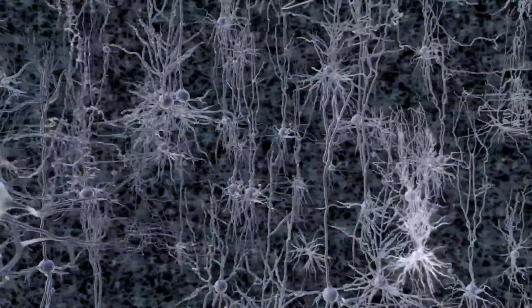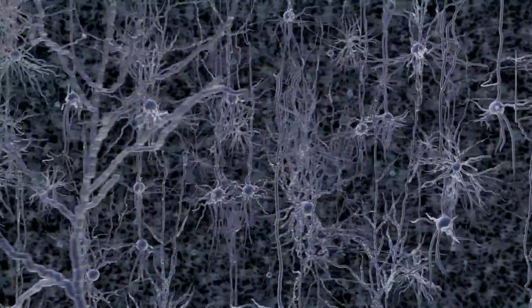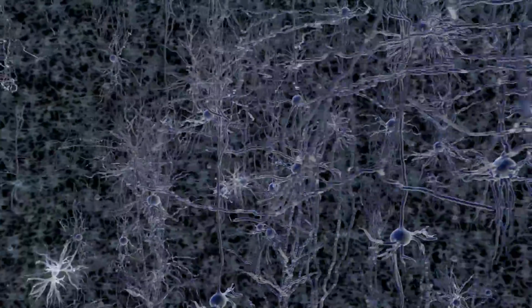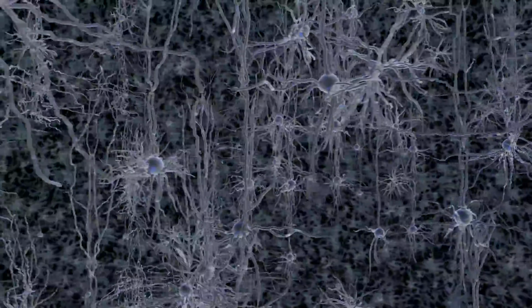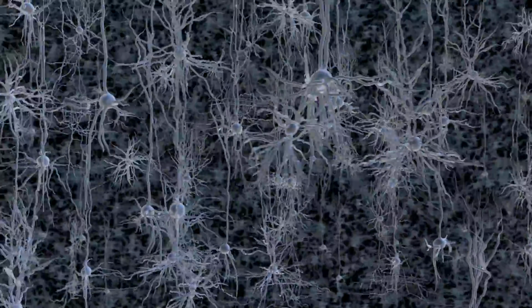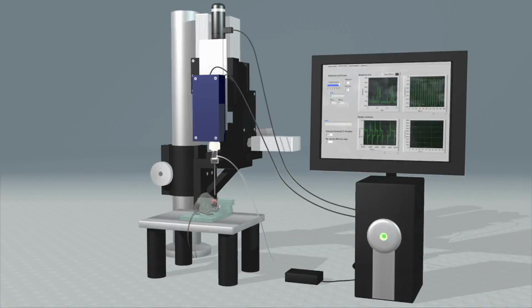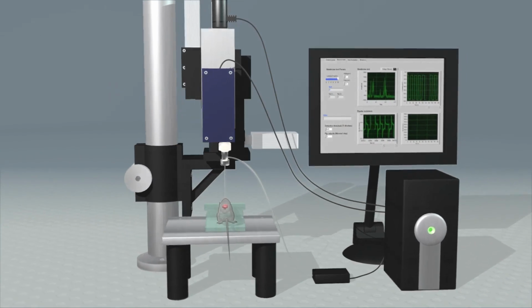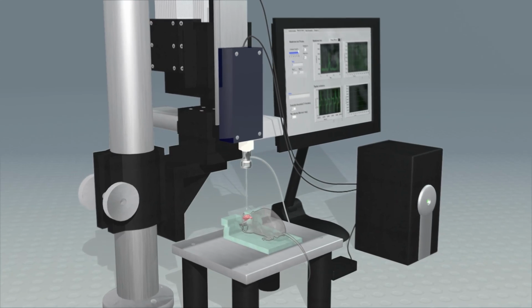In order to understand how neurons compute, ideally one would be able to observe individual neurons processing electrical signals in the living mammalian brain. And ideally, one could derive a complete list of the different types of neurons that make up the brain. By seeing how each type of neuron changes in a given brain disorder, one could identify molecules that distinguish unhealthy cells from healthy ones, which could then serve as better targets for novel drugs that have fewer side effects. A team of mechanical engineers, neuroengineers, and neuroscientists has now developed a robot that can analyze the electrical and molecular properties of single cells in the living mammalian brain.